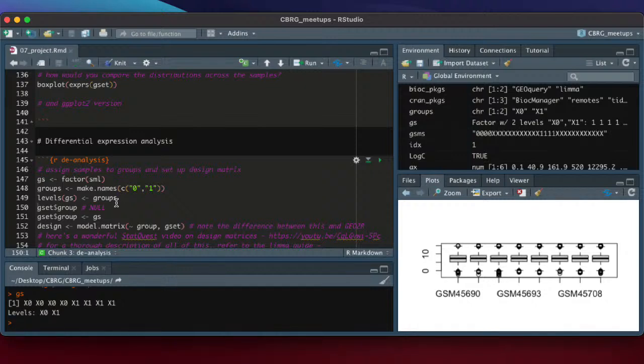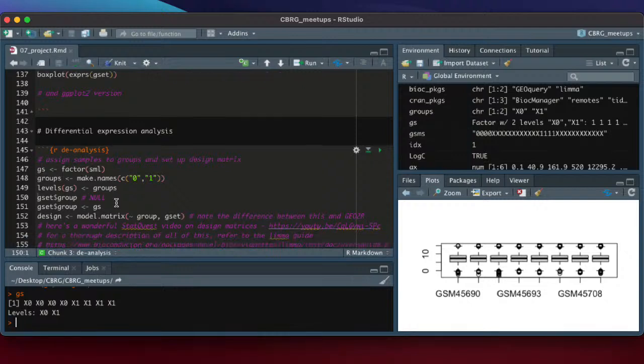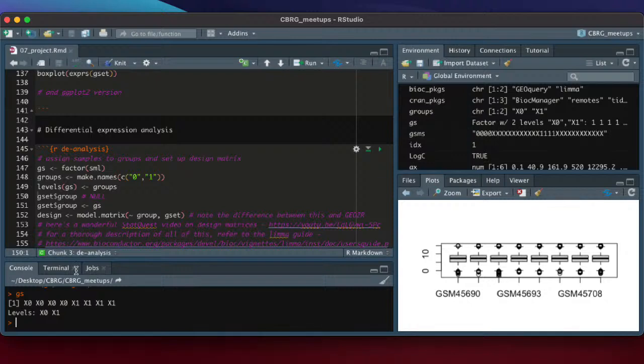Again, I'm not really sure how big, I think this is really a formatting thing, but these steps, these lines are included automatically in the GEO2R code, so I think it's just worth going through them because they're in there. Line 150 is, so if we look to see if there's something called group within GSAT, there's nothing there, it's just a null.